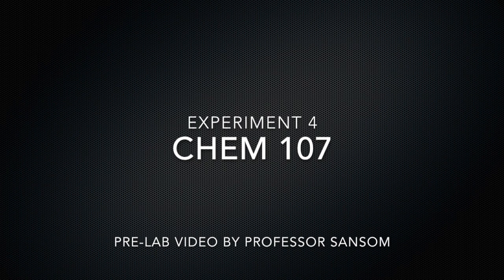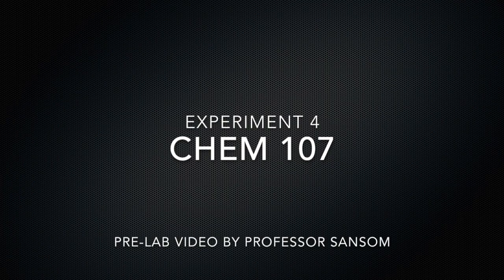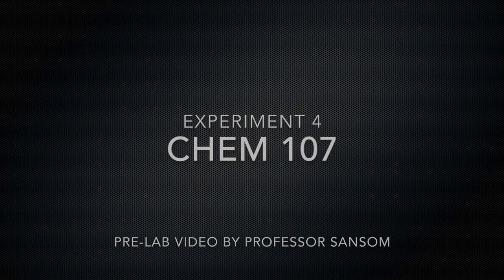In Experiment 4, you'll be using spectrometers like you used in Experiment 1. So you'll begin by doing Beer's Law, again, just like you did in Experiment 1. This time though, instead of using a serial dilution, you'll be doing a parallel dilution, meaning that you use the same stock solution for all of the solutions that you prepare.